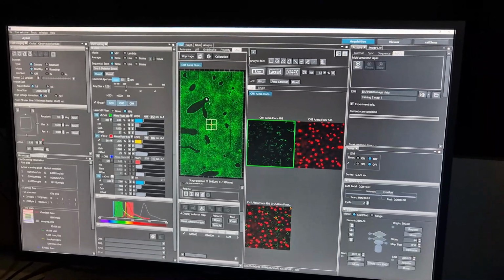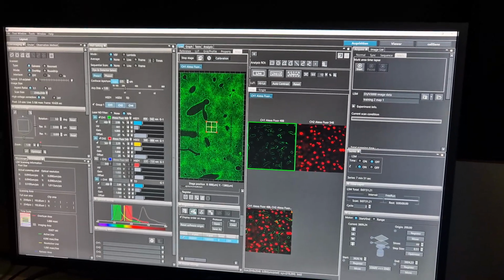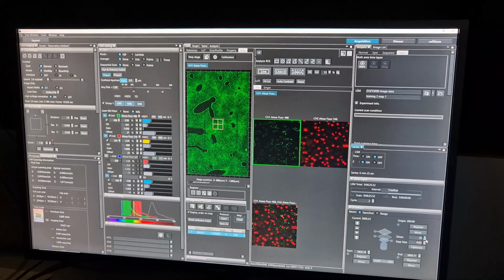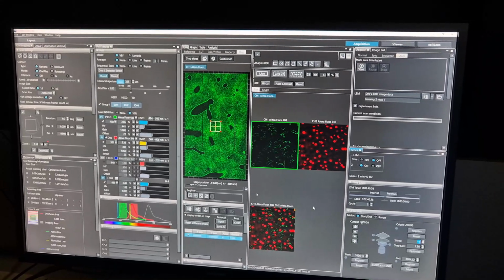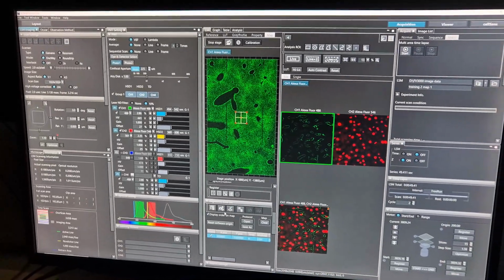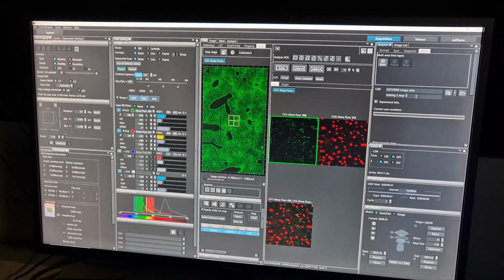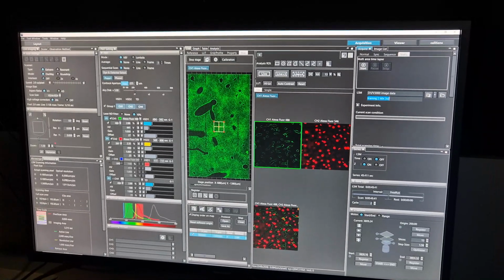And so we're incorporating within this a Z stack, which we didn't have selected before. We do now, so we'll hide that and say update parameters. And it's taking 30 minutes for this acquisition, so we'll change this to something like that. We might change this speed resolution down by half, and we'll again update acquisition parameters. And now we're getting 3 minutes, which is acceptable. And start.